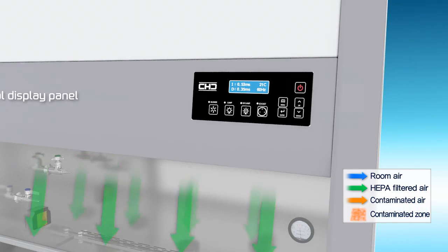CHCLAB microprocessor system with LCD digital display is for operating and monitoring the cabinet.